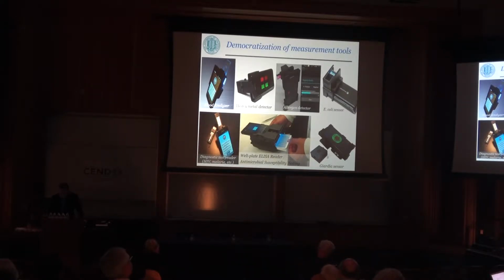For example, here is a device that is a fluorescence microscope, but it has a front end to screen Giardia cysts. You have a porous membrane here, you put your sample, several milliliters of water. Because the pore size is matched to the size of the Giardia cyst, they're stuck there and they're also fluorescently tagged. Without a need for a microbiologist, you can actually achieve about a cyst per mil level of detection sensitivity using fluorescence microscopy, this front-end disposable cartridge, and machine learning at a simple server, which could be your local laptop as well. Some other examples are shown here.